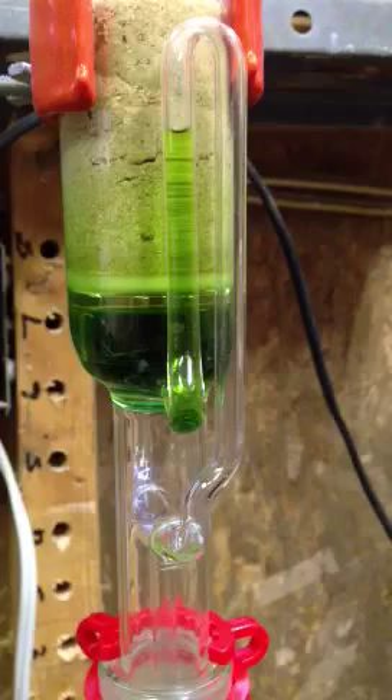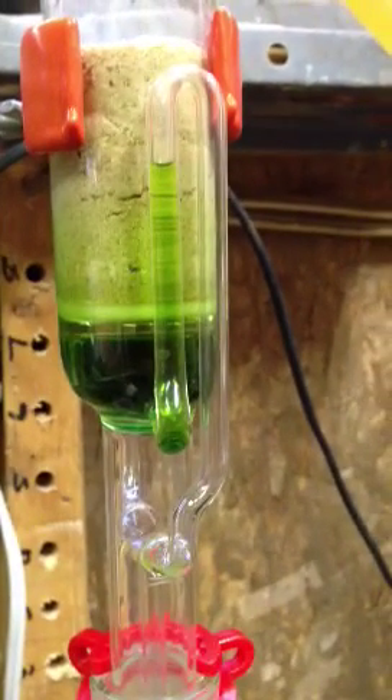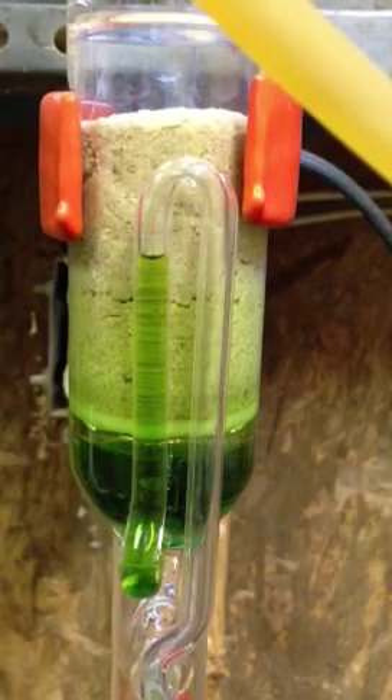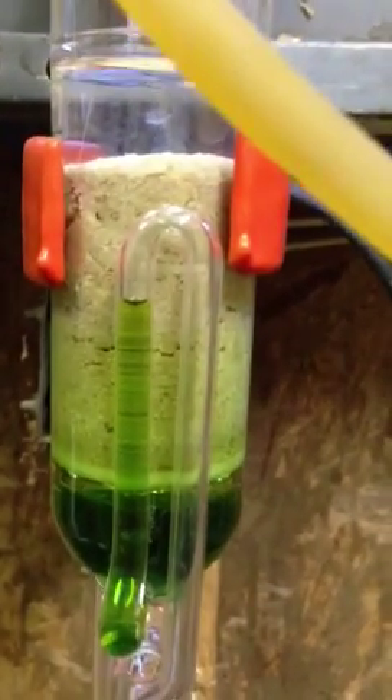Right now it looks pretty much like it's extracting just some chlorophyll. But as the level rises — as you can see here — the level will rise. When it gets to the top of that bend, it'll siphon out back through the tube on the inside, and back into the flask where it concentrates the solution.